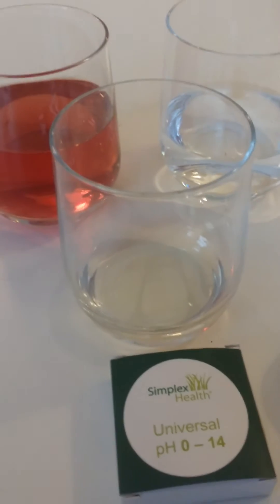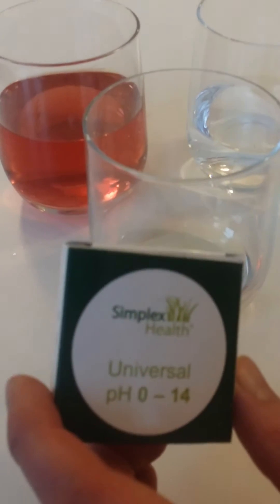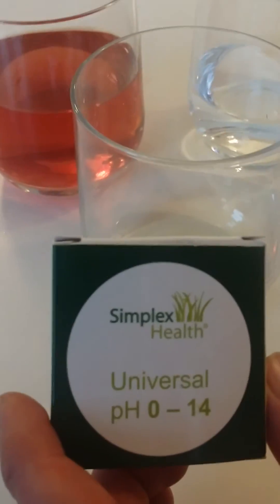Hi there, it's John here from Simplex Health. Today I just want to demonstrate how to use our Universal 0-14 litmus paper.